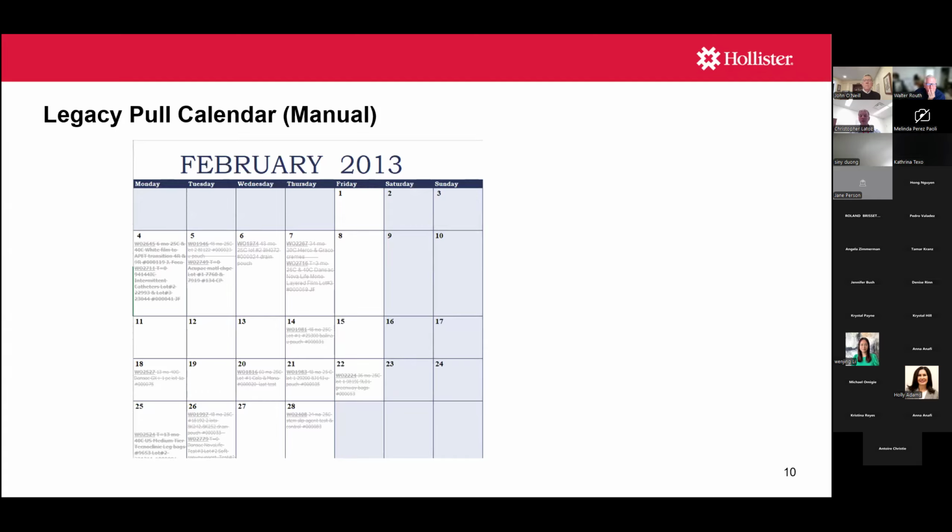Many of our studies run through 60 months because many of our products have a 5-year expiration date. So they would physically go through calendars and set the dates for the pull. As you see here, when samples were removed from the chamber, they were crossed off the calendar. So that's really how we managed our stability program.